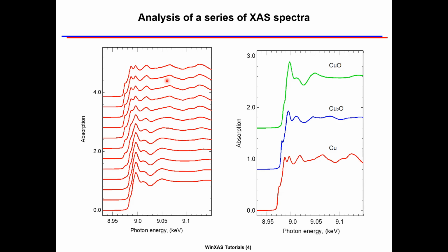For a series of sample spectra, meaning hopefully more than 2 or 3, procedures exist that allow us to answer both questions: how many chemical phases are present in this series of spectra, and are suitable reference spectra, as required for quantifying these phases, included in the database of reference spectra. The corresponding procedure is called principal component or factor analysis.